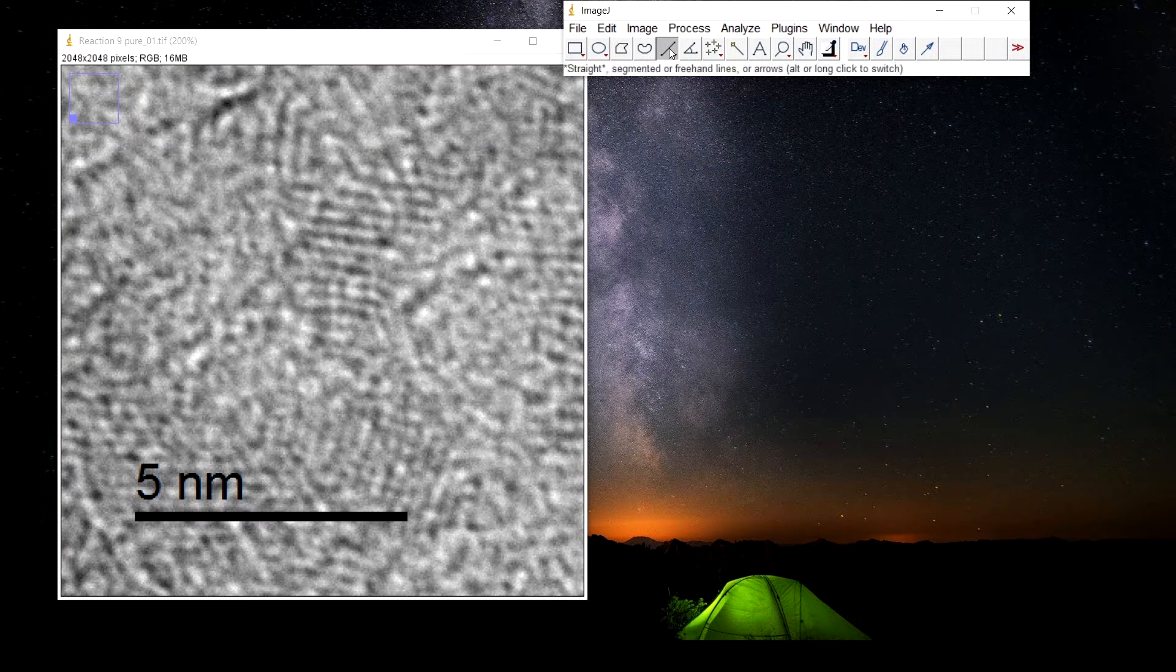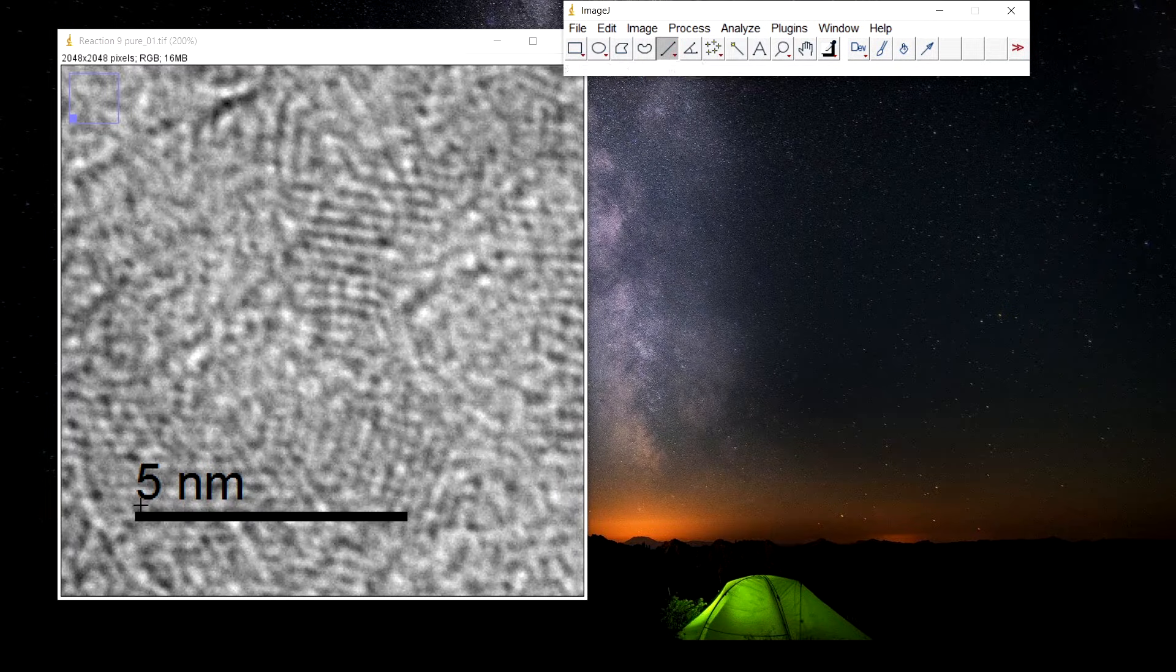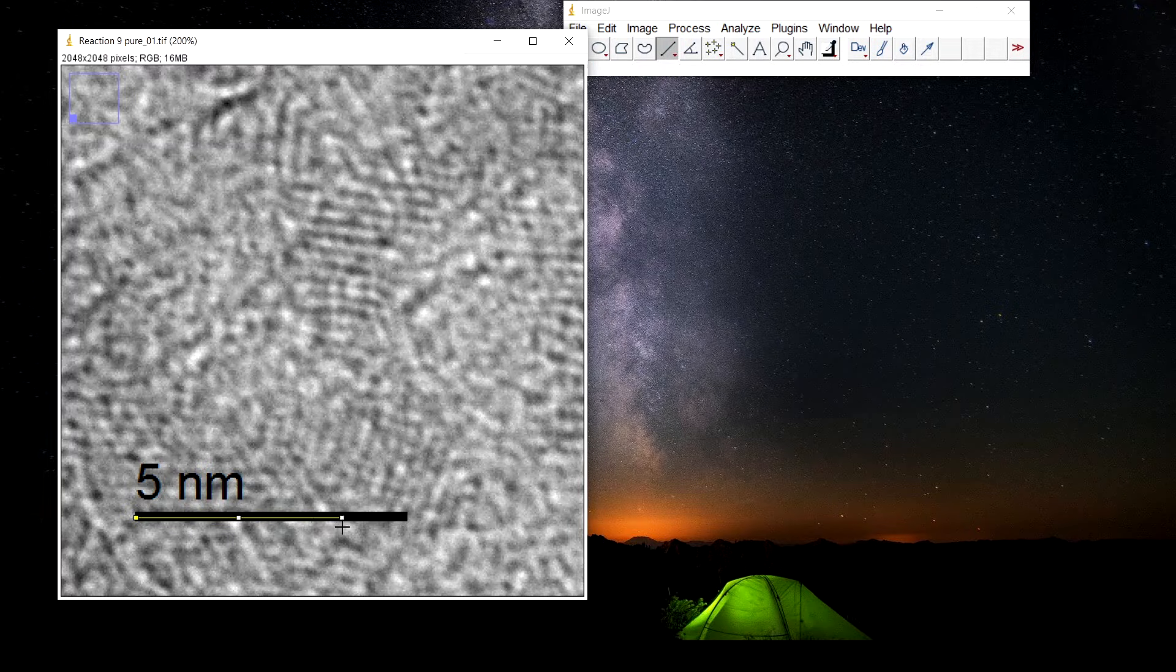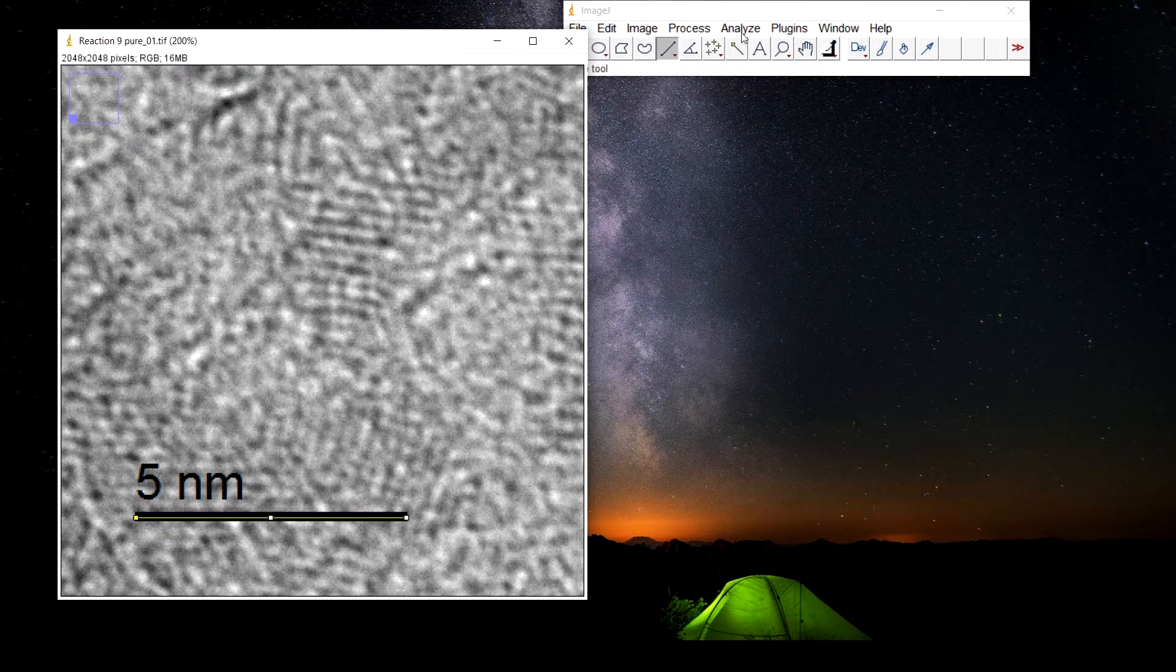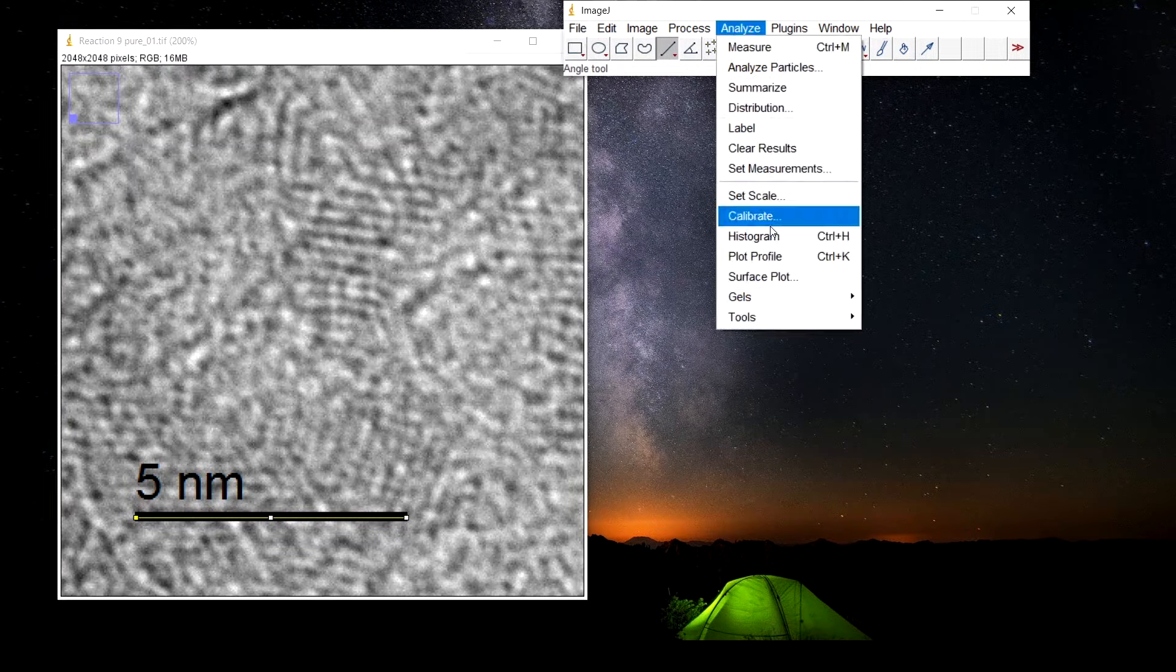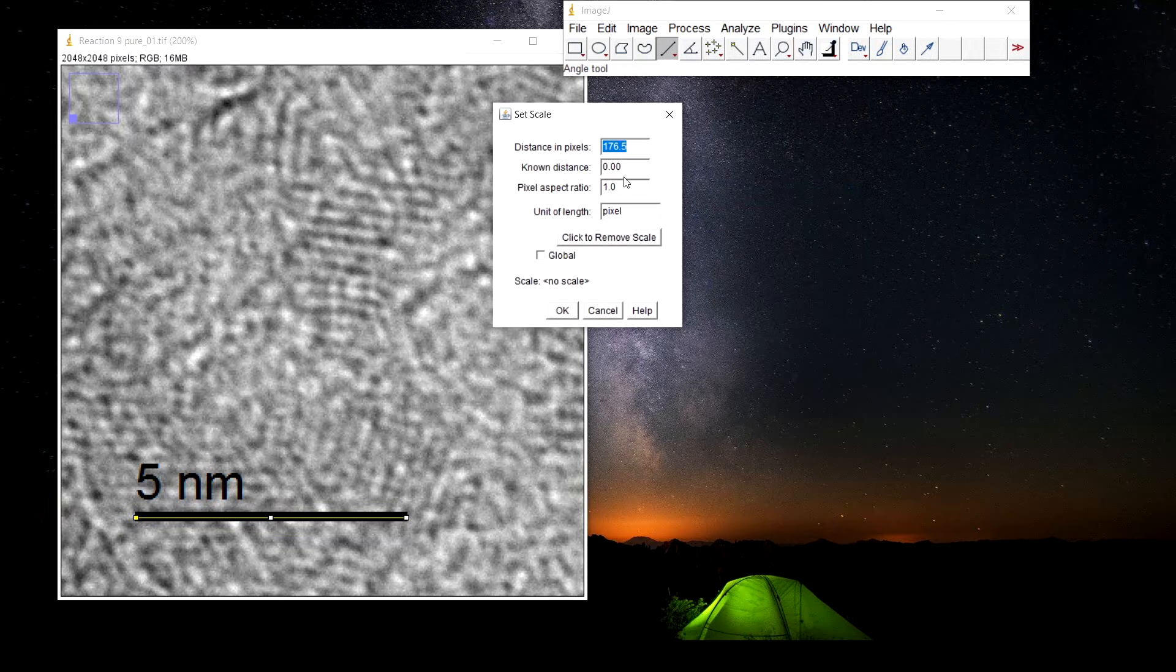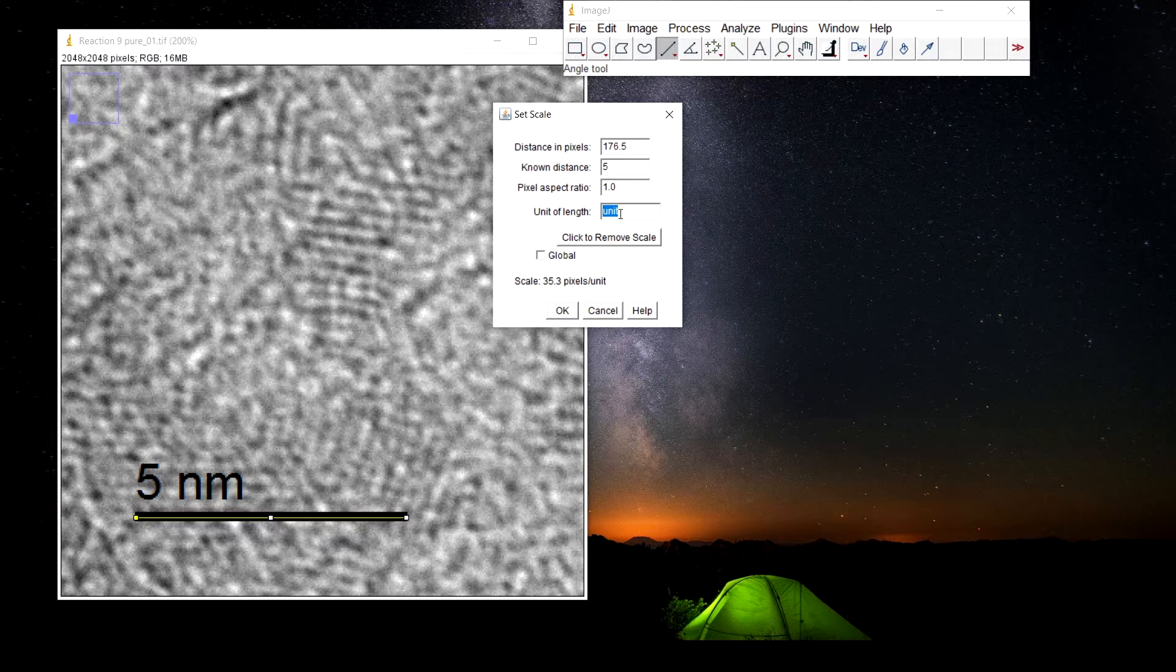Then select the straight tool, press shift and select the complete scale. Go to analyze, set scale. The known distance here is five and the unit is nanometer.